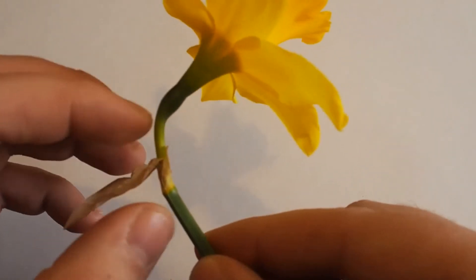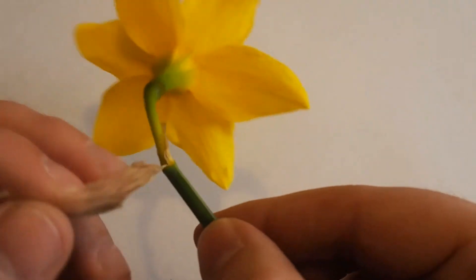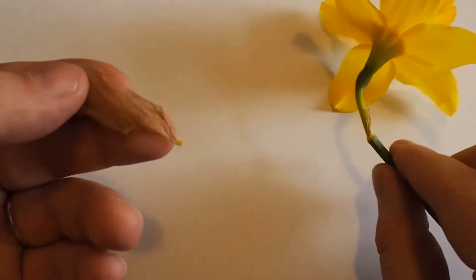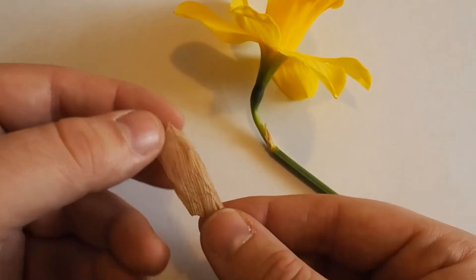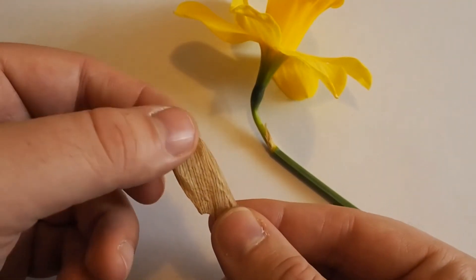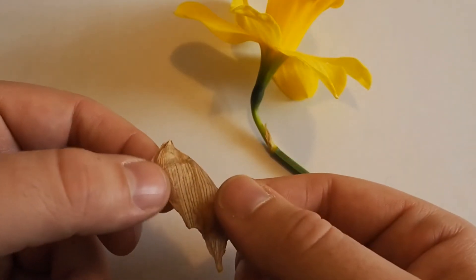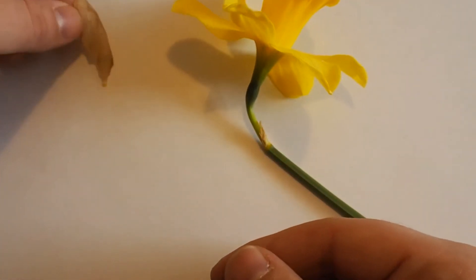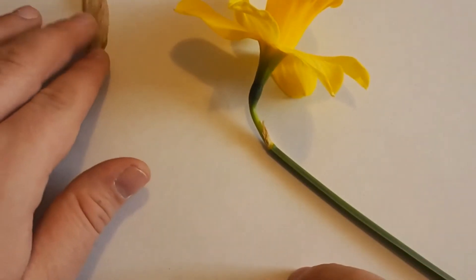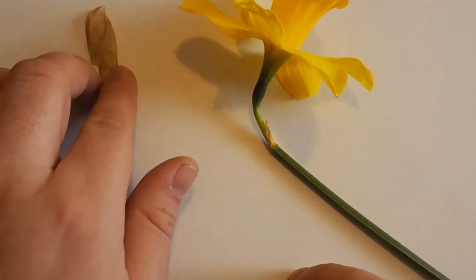We'll just fold that back and remove the spathe. When you take it off the flower, you can see those lines really clearly. That's a very clever piece of the plant — it protects it first, and then it allows the flower to open. So we'll just put that there — that's the spathe.